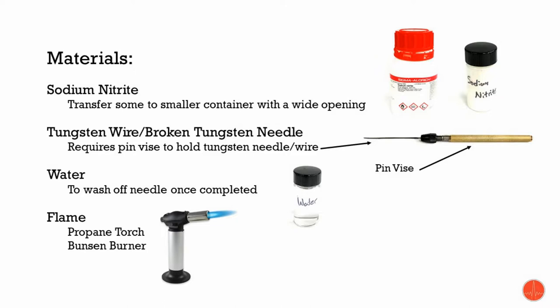First off, there's a few materials we're going to need. We're going to need some sodium nitrite, of which you need to transfer some into another container, preferably one with a large opening. We're also going to need a piece of tungsten wire, or an already broken or bent tungsten needle, and as the picture shown to the right, you're going to need a pin vise to hold the needle or piece of wire in place. We're also going to need a small container of water to wash off the needle when it's completed, as well as a flame — a propane torch or a Bunsen burner — to heat the needle up.